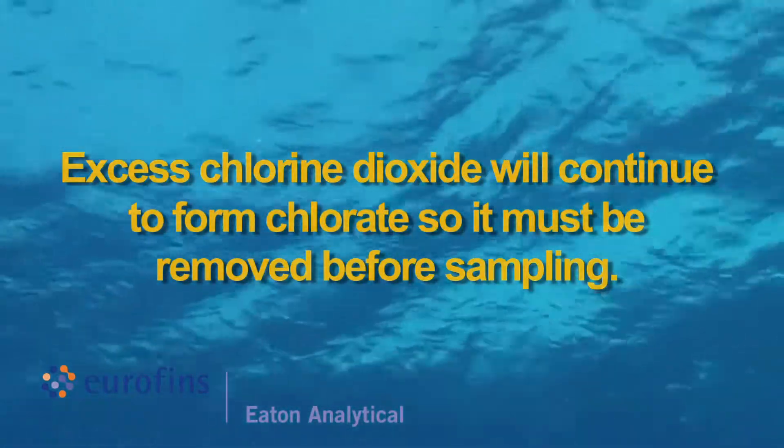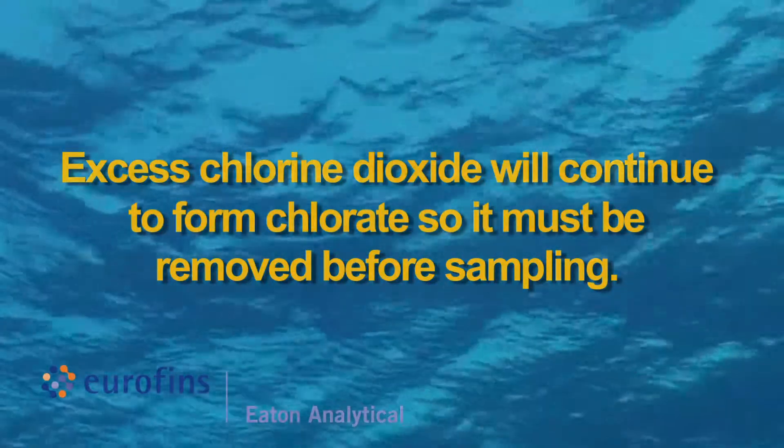Excess chlorine dioxide will continue to form chlorate, so it must be removed before sampling.